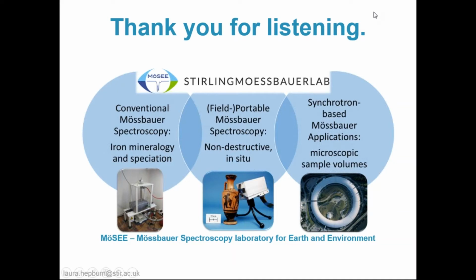Great talk, and I can see that a lot of the literature has used this method, yet you presented a lot of worrying issues with this method. What implications does this have? Well, for each individual hypothesis? No. Well, just in general, it means that the phase that you're expecting to remove isn't being removed. So if your subsequent analyses, your isotopic measurements or any other microscopic work you're doing with that sample, is based specifically on carbonate, it's not. It's also including all these other phases that aren't being removed.